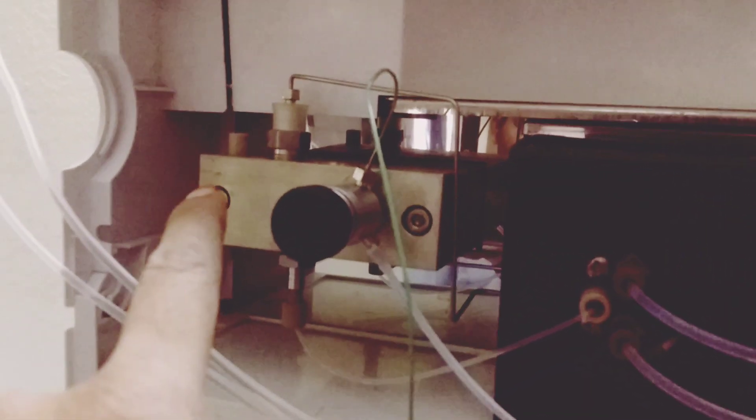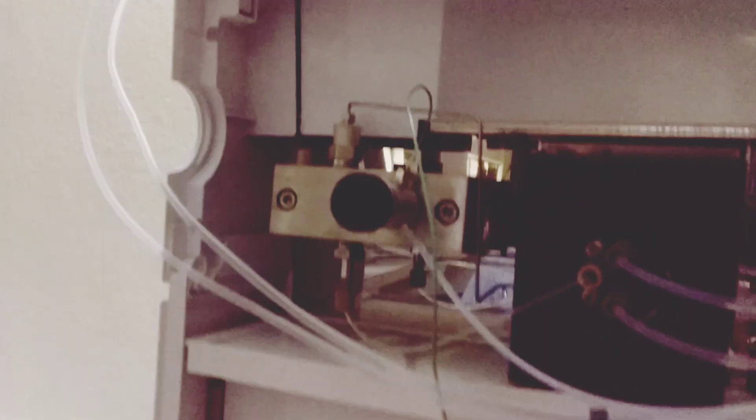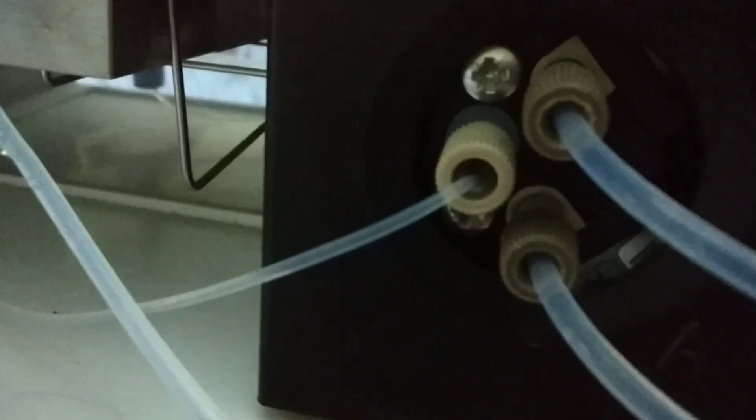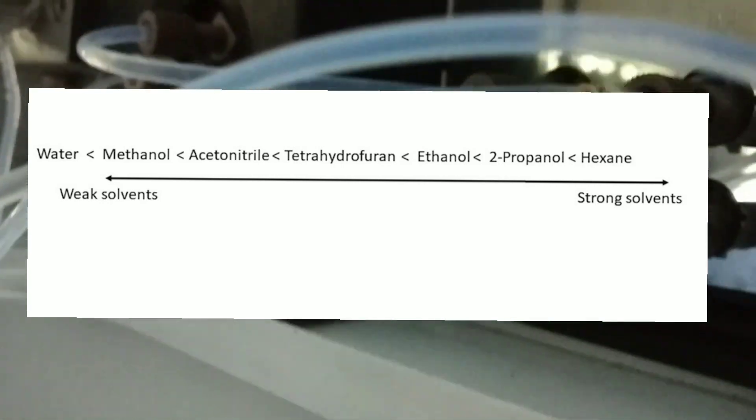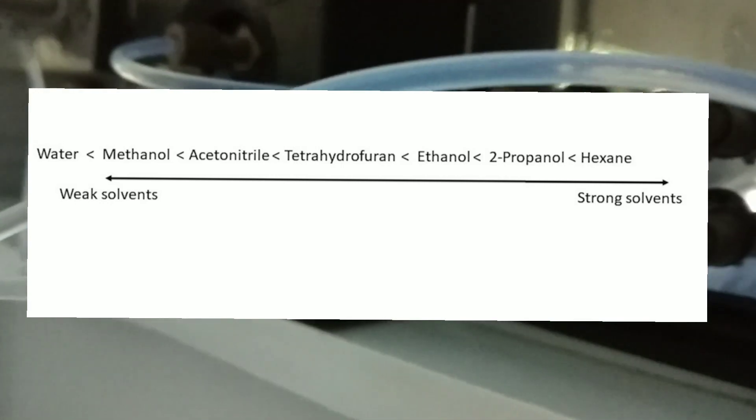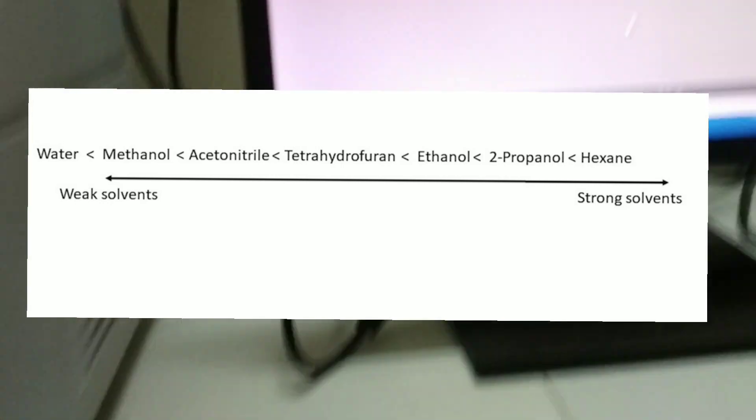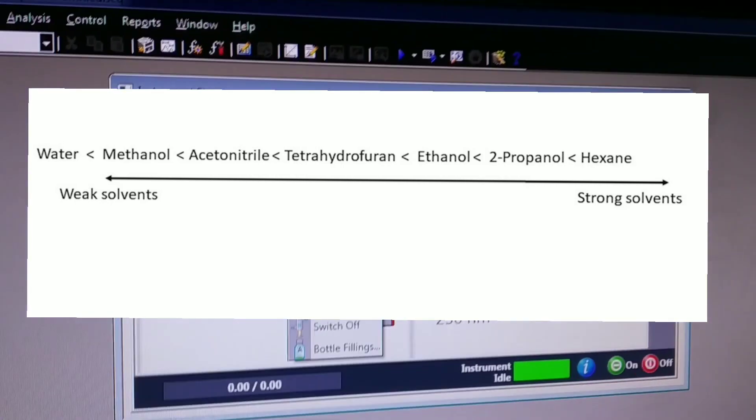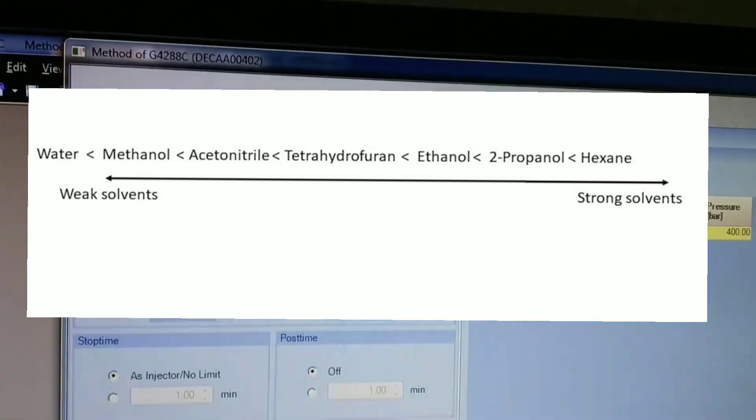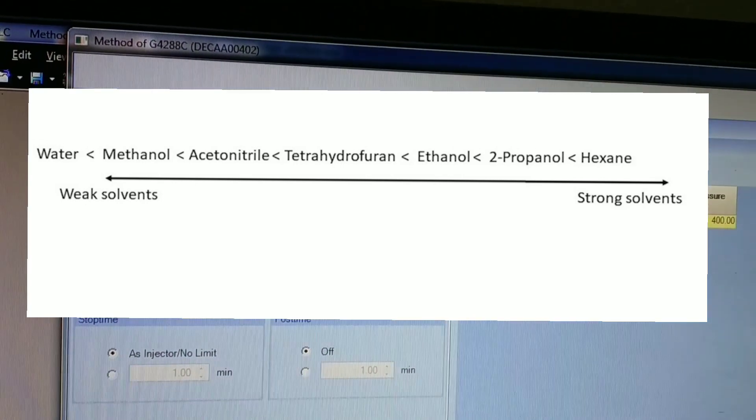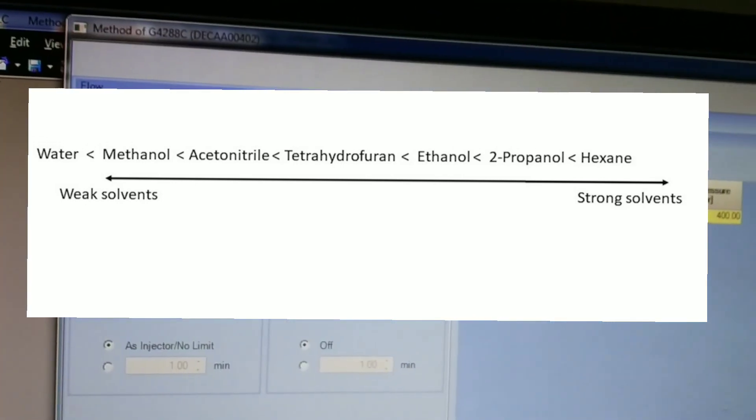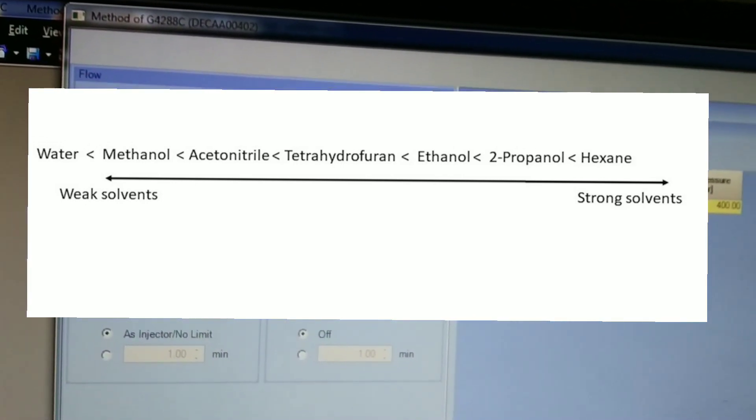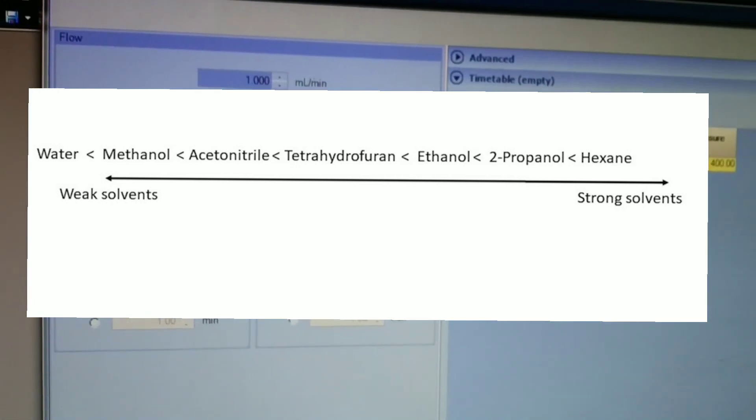Here you can see that the solvent moves from the reservoirs into the degasser, from the degasser into the pump, and from the pump into the outlet. Here are the wide variety of solvents that can be used for flushing the column. It starts from the weak solvent like water and methanol, and as you move forward you can see the stronger solvents like 2-propanol and hexane.